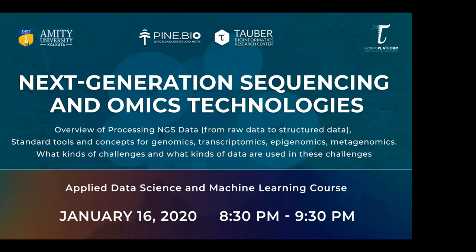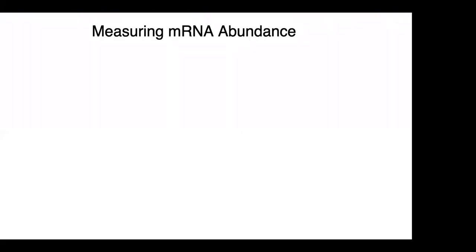We talked about mapping reads, genes and isoforms, and different types of file formats. So today, I wanted to recap the different methods to measure mRNA.